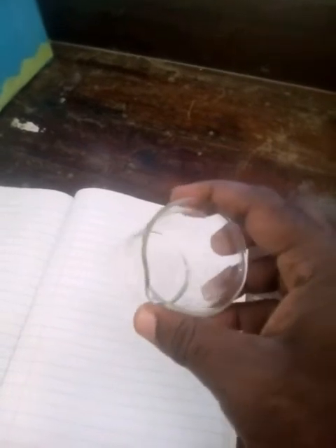It's not colorless, but it is not an intense color. It has a shade. So just notice the color for now, so that as the reaction occurs, you can observe any change that you will see.